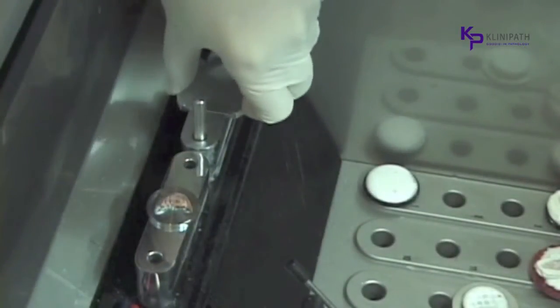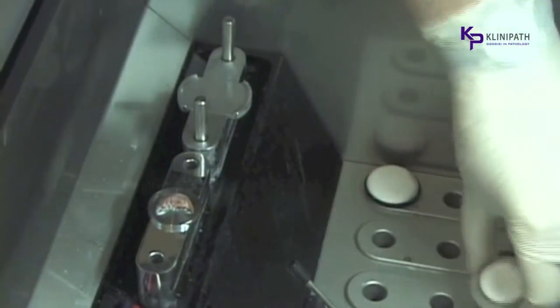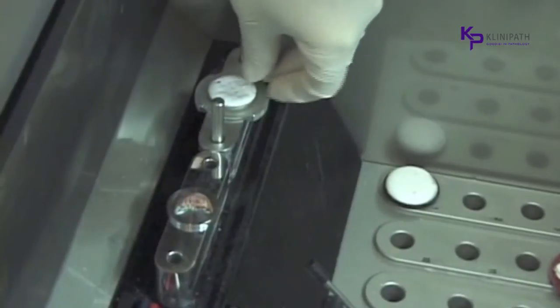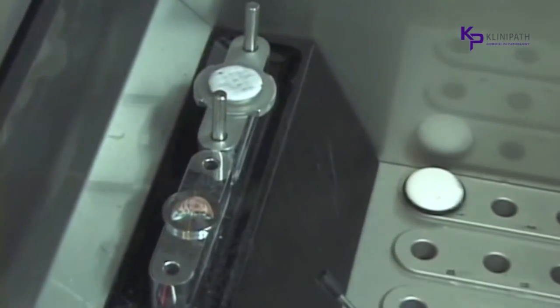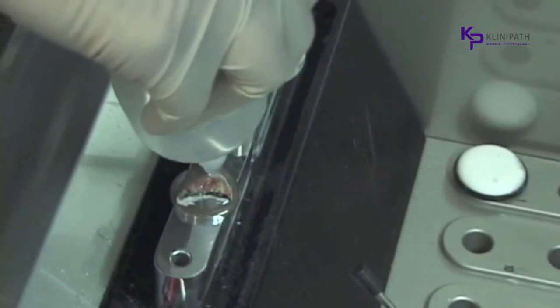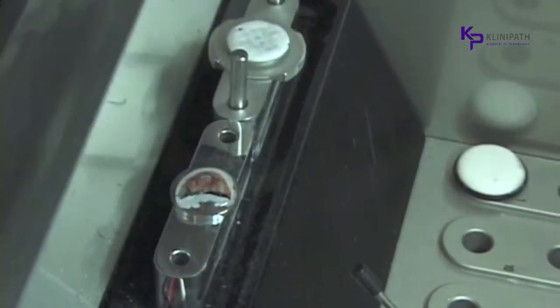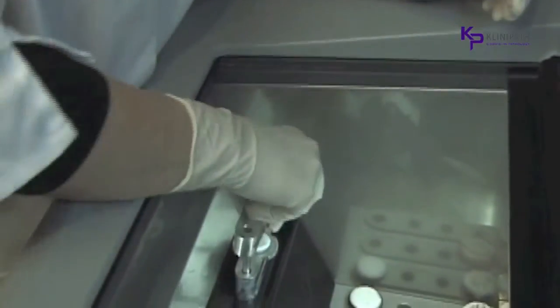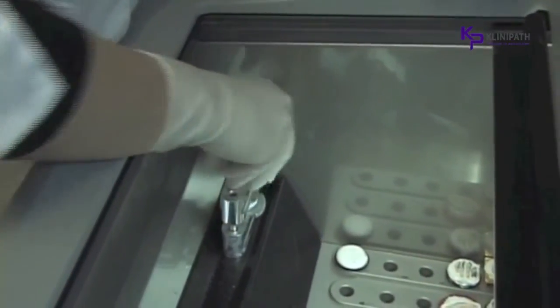This adapter is used for the regular and large size Thermal Shandon chucks. A technician's least favorite part of tissue processing is adjusting and readjusting the chuck holder so the specimen is parallel to the blade. When using the Cryoembedder to freeze and orient specimens, each specimen is lowered onto the posts at the same angle, so very little if any adjustment will be needed when cutting.